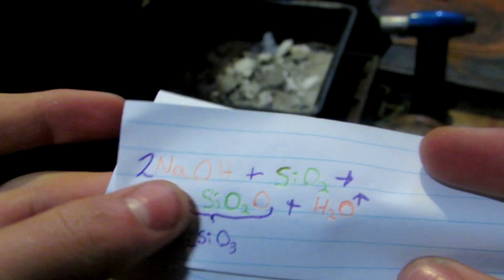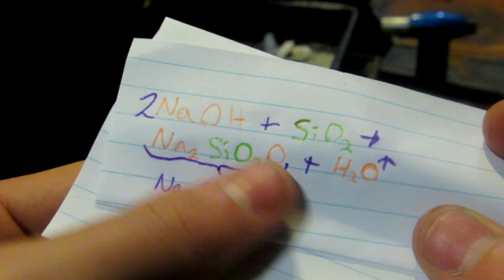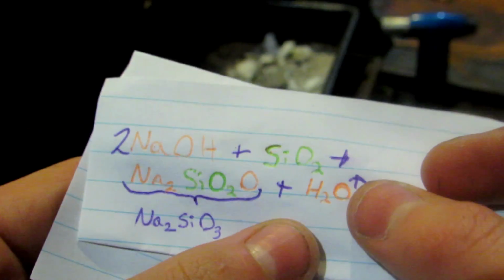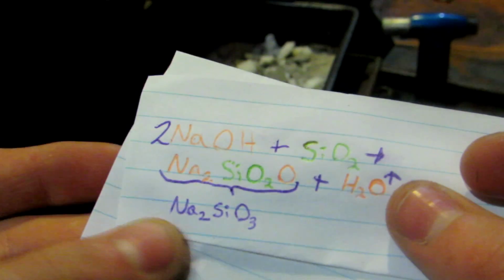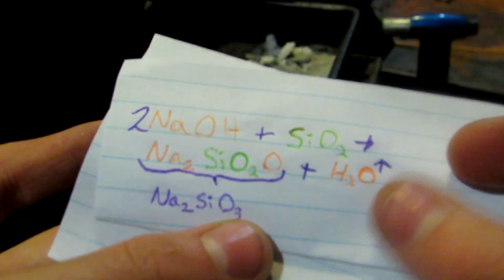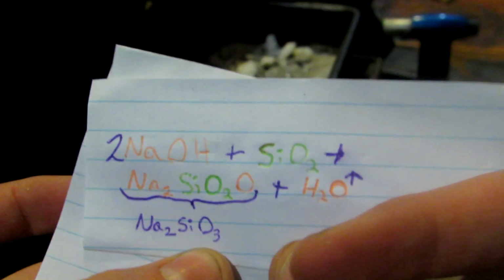So our sodium hydroxide is now melting and undergoing the following reaction, which I've written out. So, we have 2 sodium hydroxides plus silicon dioxide, which is sand, which gives sodium silicate, and I just wrote the O in orange here because it came from this one, and water, which goes off as a gas because of the high temperatures. And then this is just simplified to Na2SiO3, sodium silicate.